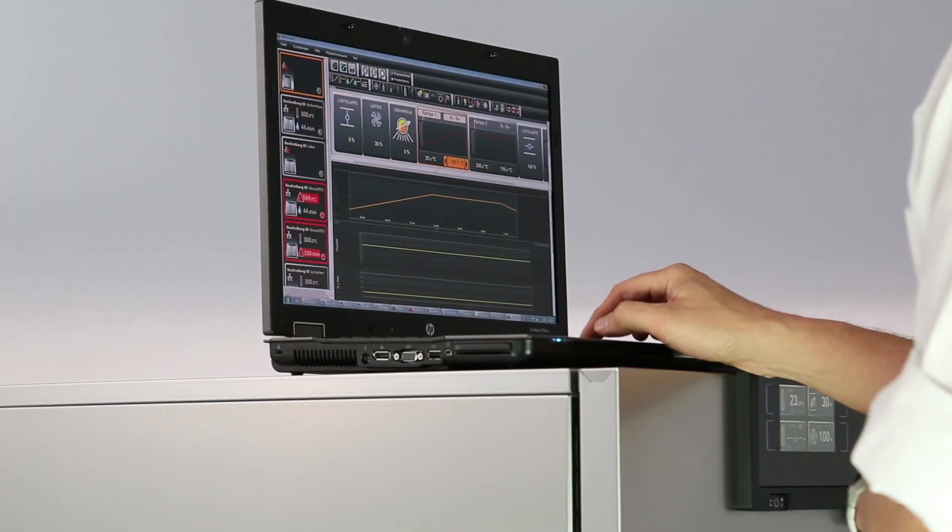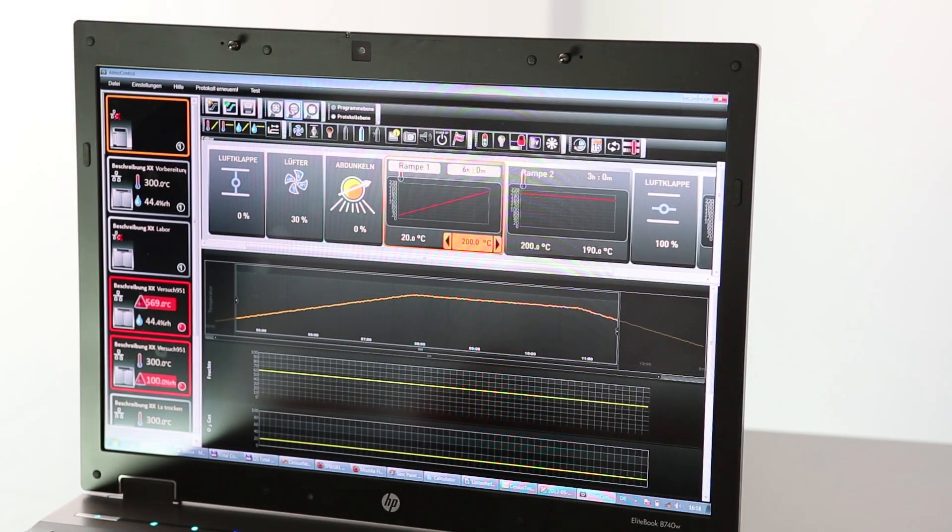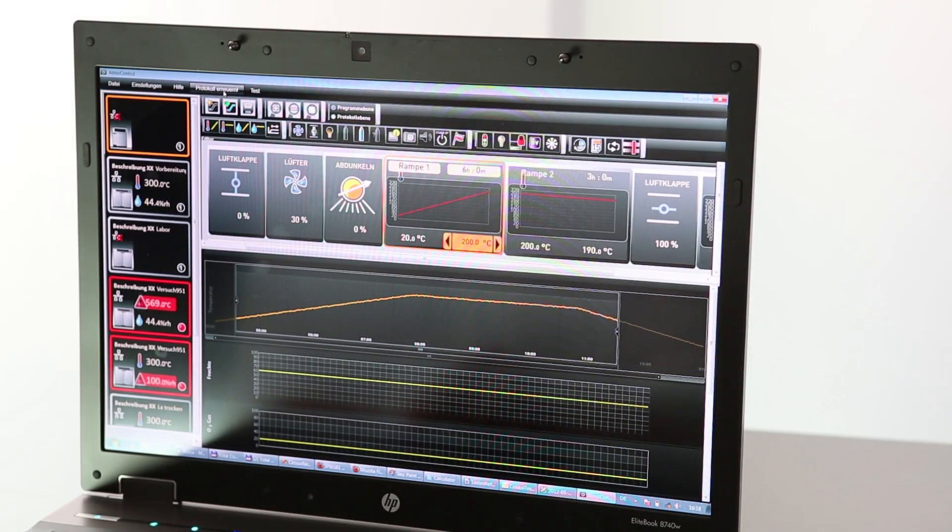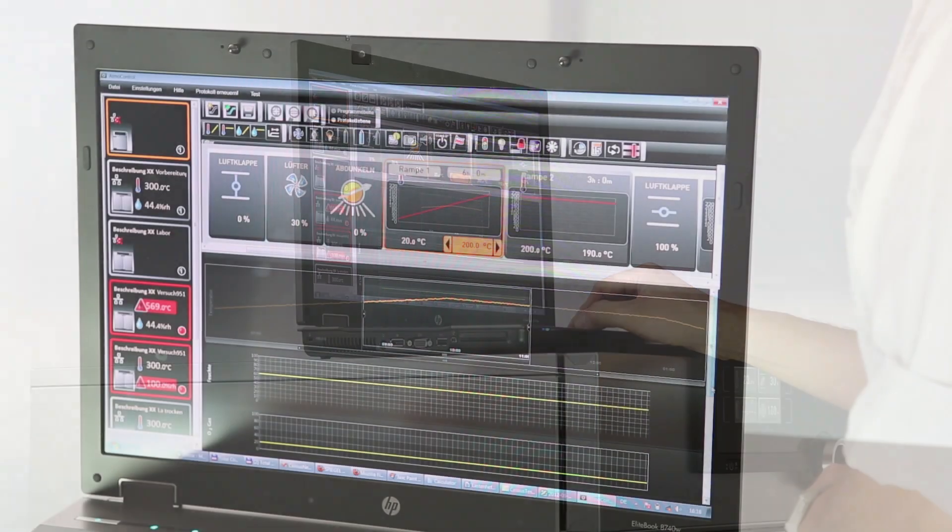And to give you a good overview, AtmoControl shows the process sequence graphically while you are programming.